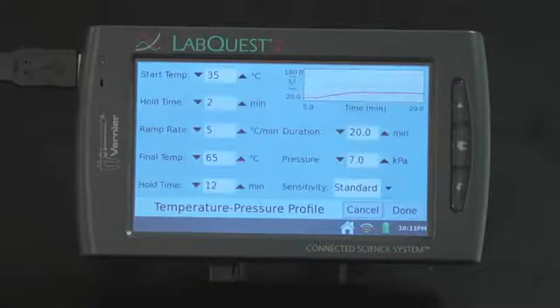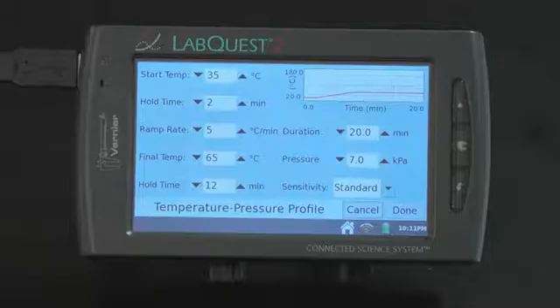Depending on your sample, you may need to modify these parameters to obtain good separation. For this sample mixture, change the pressure to 4 kPa.